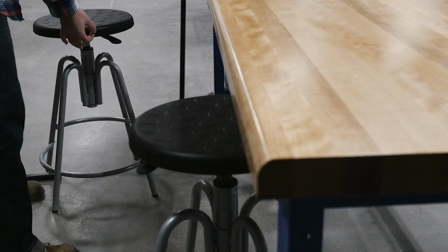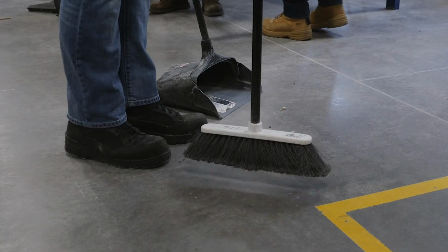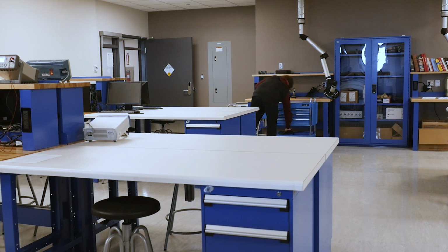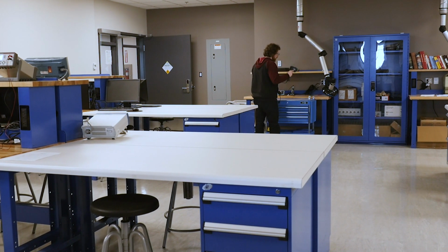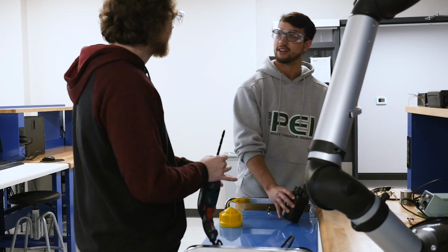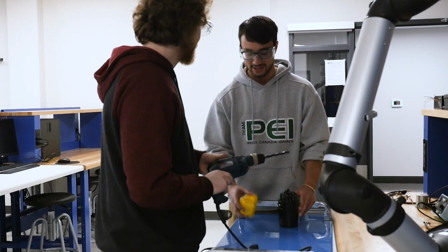Keep your workspace tidy and clean up spills promptly using appropriate procedures. Tidy and clean up after yourself before you leave the lab. Do not work alone in the lab, because if there is an accident, you will not have someone to assist you. At all times when you are in the laboratory, you should work in such a way as to minimize both your own exposure and your fellow students' exposure to any hazardous materials or processes.